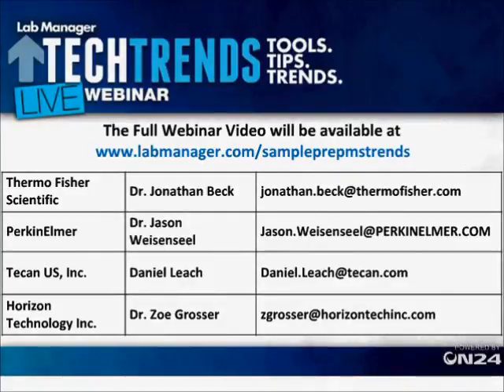You mentioned the EPA there. Has the EPA accepted SPE for wastewater analysis, do you know? We actually have been working with the EPA on that, and they're in the process of creating a small round robin to gather some data on method 625 using SPE techniques from a variety of vendors. So they would like to include it, but because it is a regulated community that's very strong, I think they need to have a lot of information to support their position.